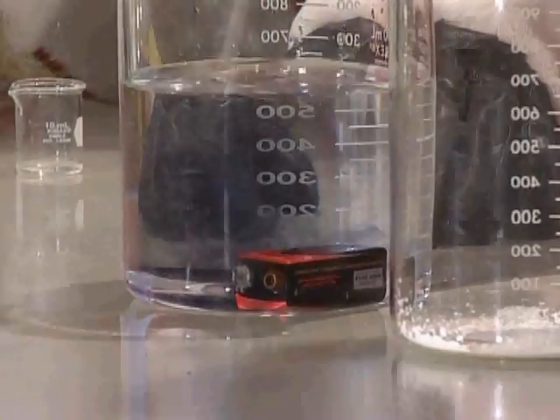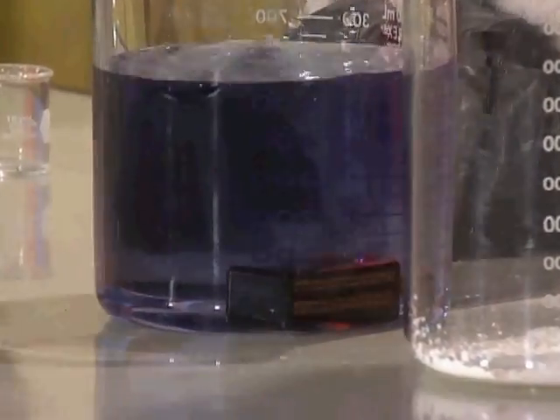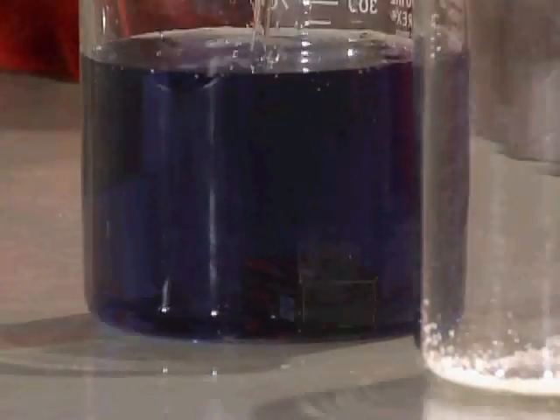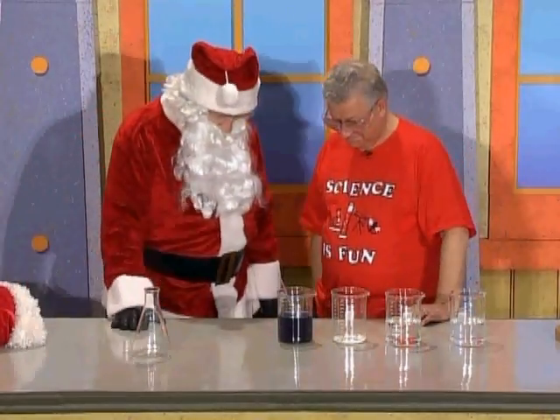Here we go, I'm going to put this in there. What color do you see now? It's turning blue! Look at that! This is a battery-operated chemical reaction. Wow, look how blue that is! That's great, good job.